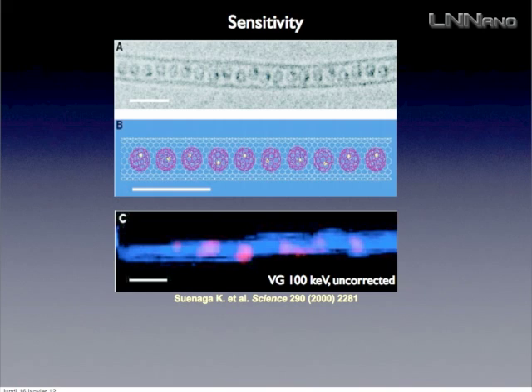Of course, at the time, it was a state-of-the-art experiment, but it's a proof that you don't really need spatial resolution in some cases. Here, it's gadolinium atoms within fullerenes, which are embedded in a carbon nanotube. It's called peapods. And the question was, can we detect these single atoms? And the answer is yes.